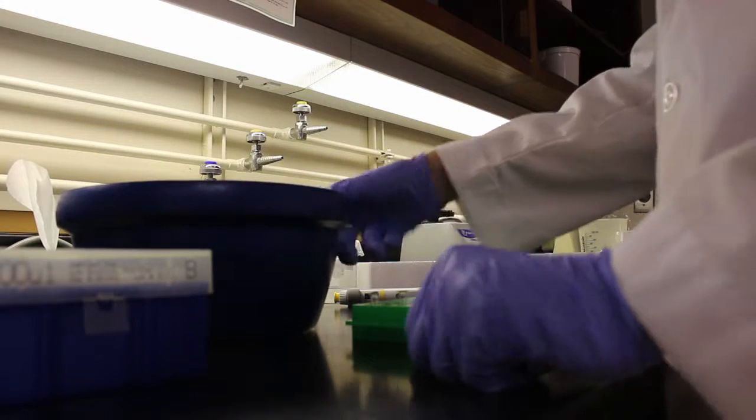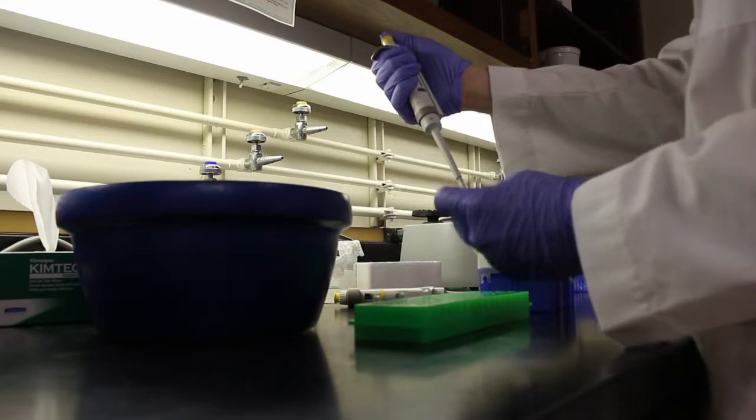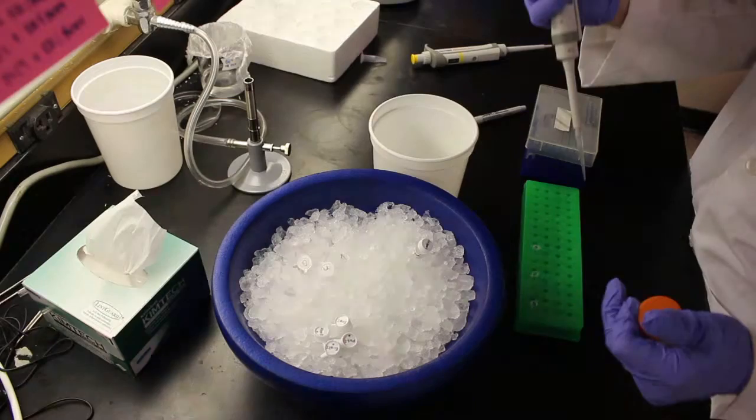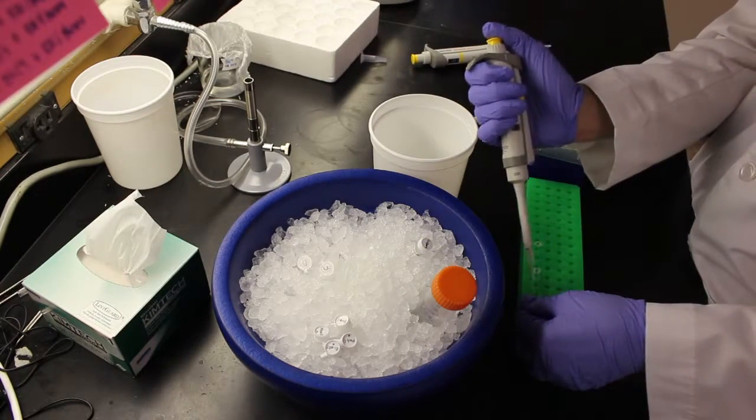Make sure all components are kept on ice. Add 500 nanograms of each DNA plasmid to three separate 0.2 milliliter tubes, and add USP water to a total volume of 43 microliters.